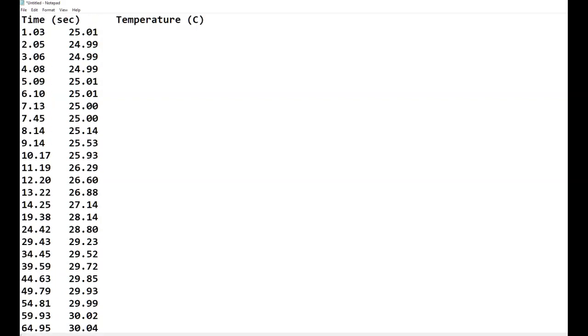And then subtract our initial temperature from it, and that's going to be your delta T. Okay, so this is the data for dissociation of sodium hydroxide in water. So it's called the heat of solution. Okay, I'm going to stop there. That's the first set of data for heat of solution, solid sodium hydroxide in water.